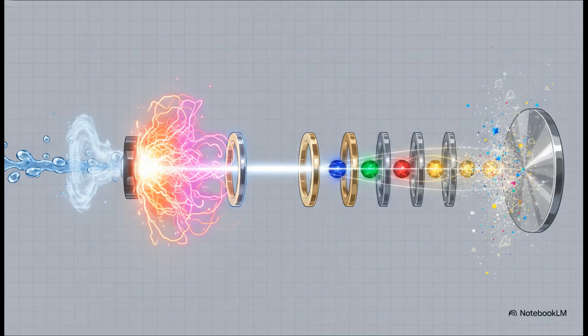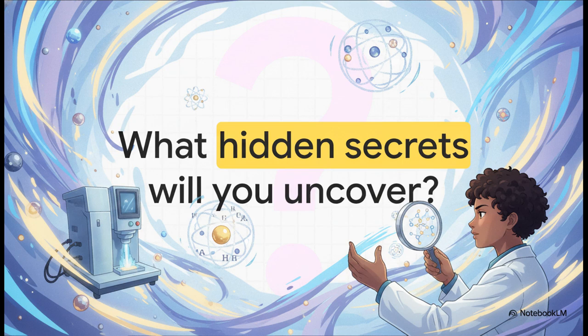What an epic journey our sample just took. We started with a simple liquid droplet, used a nebulizer to convert it into an aerosol, and plunged it straight into a 6,000-degree argon plasma. We navigated the vacuum interface, used electrostatic lenses to focus a beam of ions, and utilized a quadrupole to sequentially filter those elements by their precise mass-to-charge ratio. Finally, we turned those ion counts into incredibly precise, ultra-trace quantitative data on a computer screen. You now understand the profound physics and engineering working seamlessly inside an ICP-MS.